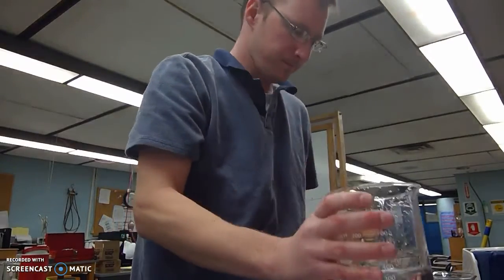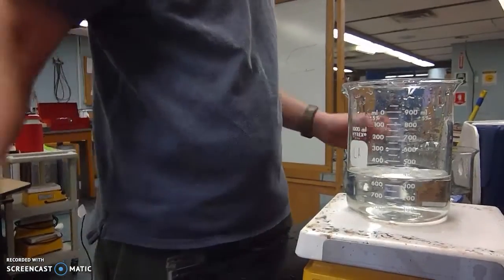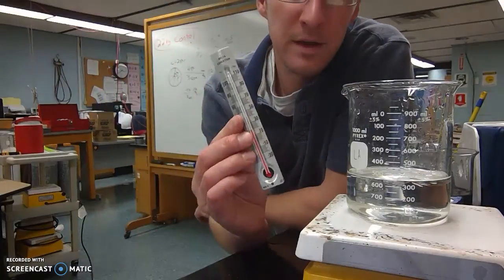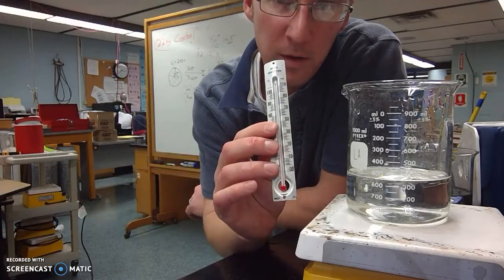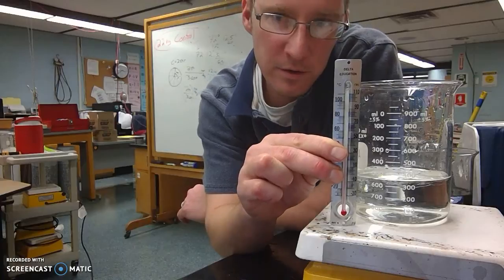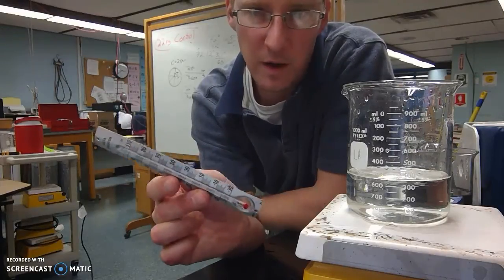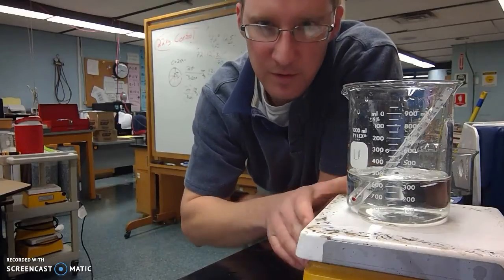a beaker that you'll just put on top of the hot plate. The hot plate, I assume, is at 0 degrees. It's at room temperature. You will then take a thermometer. This is the kind of thermometer I want you to use because the bulb of the thermometer isn't going to be able to come into contact with the bottom of the beaker, so it's not going to come into contact with the hot plate. That means the thermometer is going to take the temperature of the water, not of the hot plate. Boom. Take that temperature twice every minute, every 30 seconds.